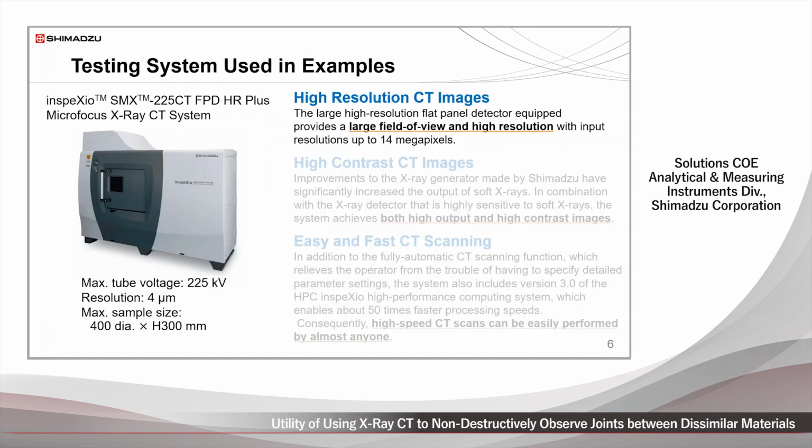This is the system used to acquire the transmission and CT images shown in this presentation. It is an Inspectio SMX 225 CT FPD HR Plus microfocus X-ray CT system. The system offers three key features. The first is the large, high-resolution flat panel detector, which enables the acquisition of high-resolution images with a large field of view.